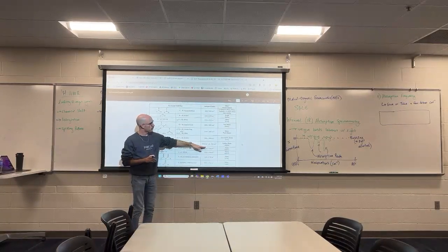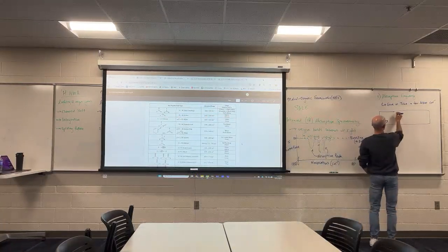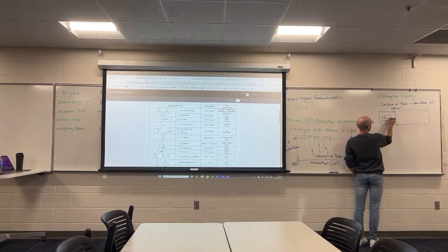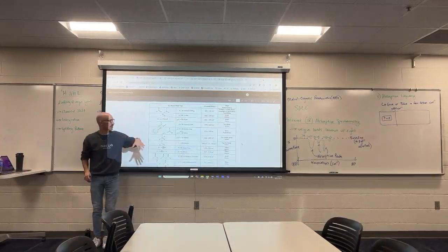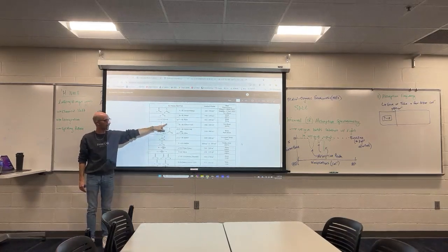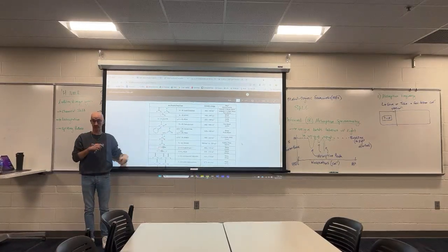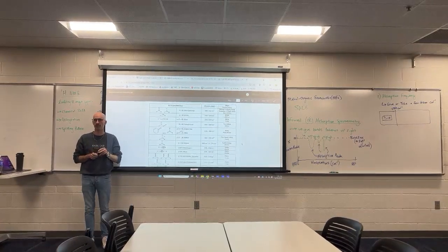Looking from 2,500 wave numbers up to 4,000, we can say that these are bonds between something and hydrogen. Notice how all of those high frequency absorption ranges, NH, OH, CH, a different kind of OH, a different kind of CH, a different kind of CH. These all absorb at different frequencies.